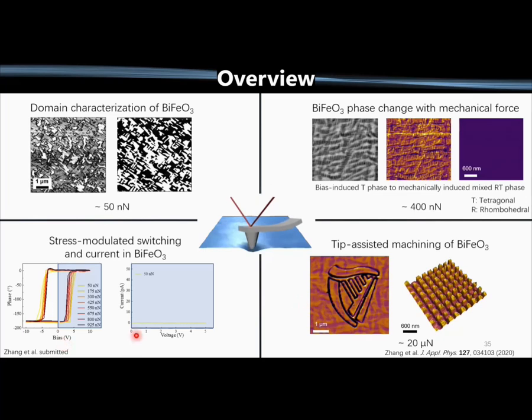And we can look at the evolution of both the coercive field or the nucleation voltage, as well as a switching related current. You can see we didn't see a strong current at low forces. And as we go to increasingly higher forces, you can see that the magnitude of this current peak increases, but it also shifts a little bit to the left. I'm giving away the main experimental results already, but this is what I'm intending to talk about: this shift in the current and the increase in the current peak.